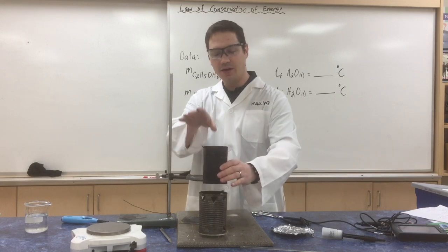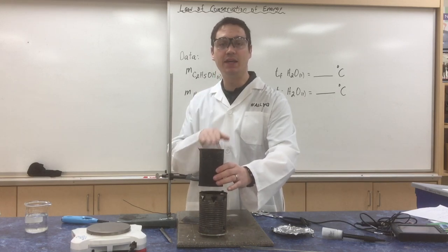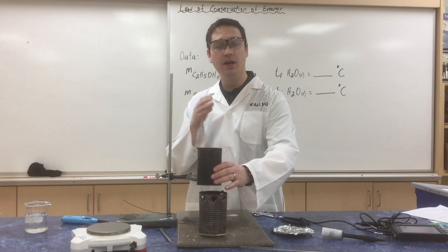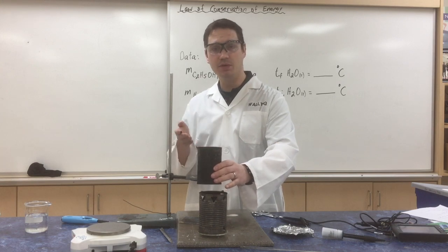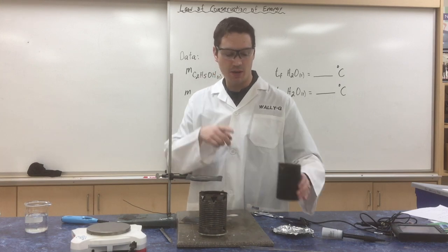So we're going to have the can of water on top and the ethanol gel on the bottom. The ethanol is being burned and it's transferring the energy to the top can.